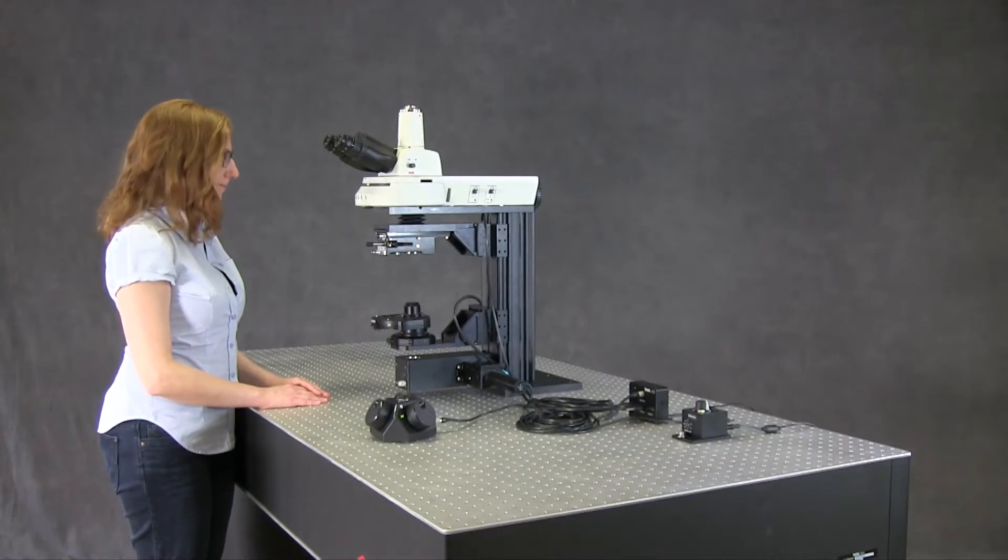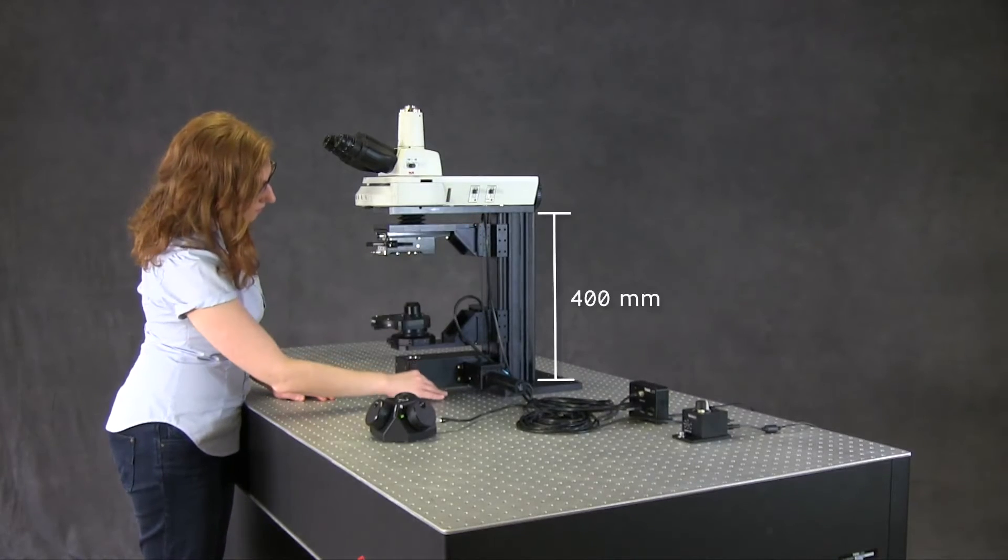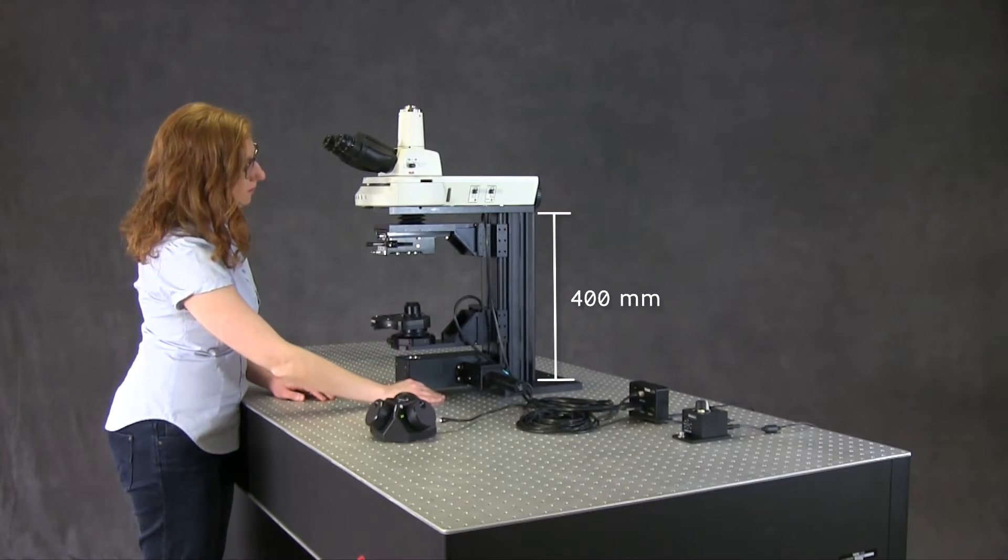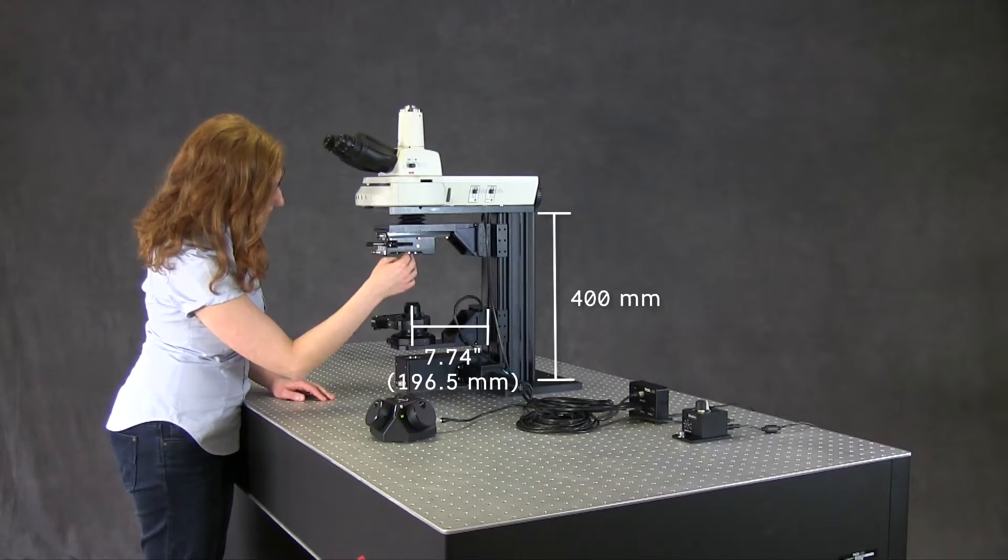To maximize the working room around the optical path, this microscope uses a 400 millimeter tall body. Like all CERNA microscopes, it also offers a 7.74 inch throat depth.